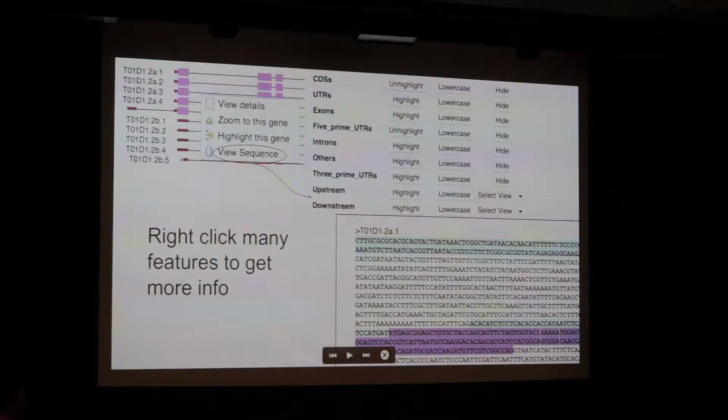One thing that I will show you a demo of, but I wanted to make sure I made a slide of, because I get this question on a fairly regular basis, which is, how do I get some sequence? People ask that a lot.